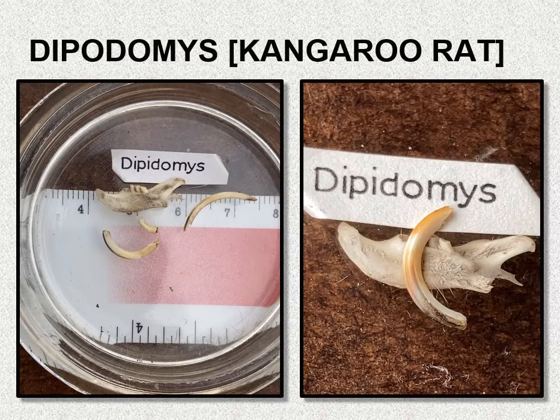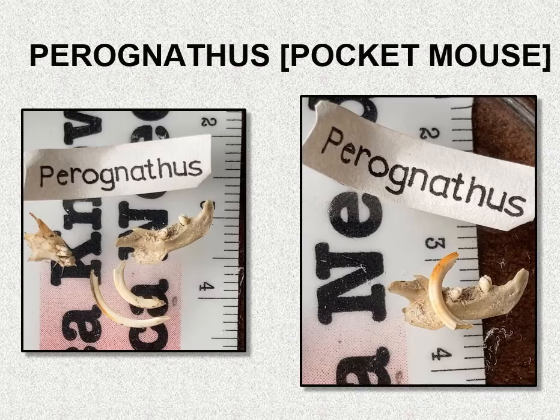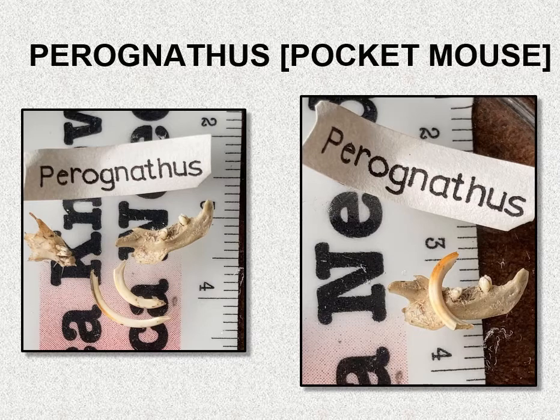This is a kangaroo rat, a Dipodomys. Some of these rodent species have a grooved upper incisor, and I'm showing you that on the right — that's an upper incisor; I'm using the lower jaw just to position that tooth. Kangaroo rats are a sage species. Here is a pocket mouse, a Perognathus. Again, the upper incisor is grooved — it's been slightly fragmented.